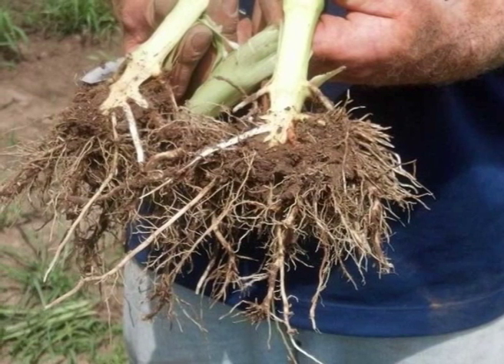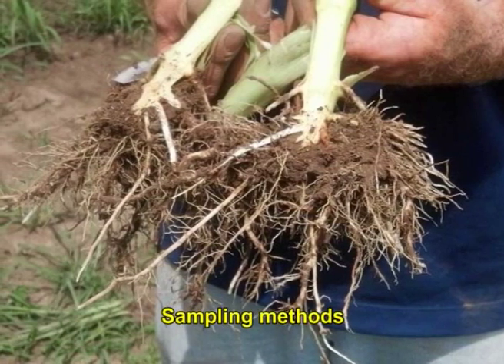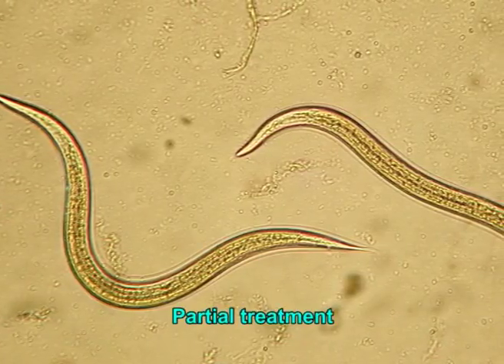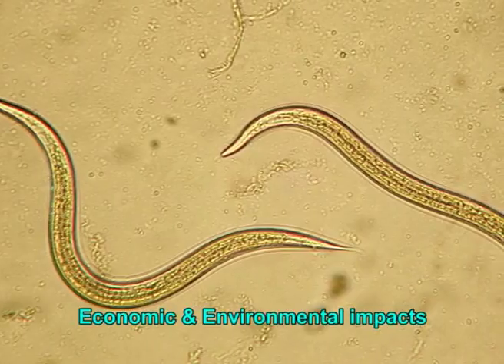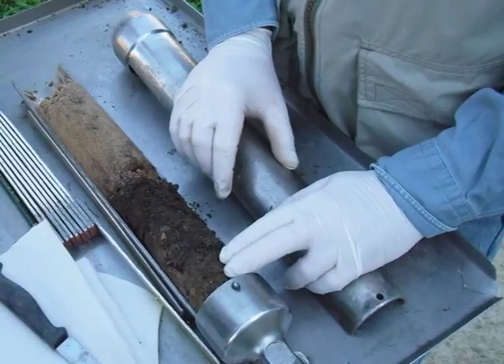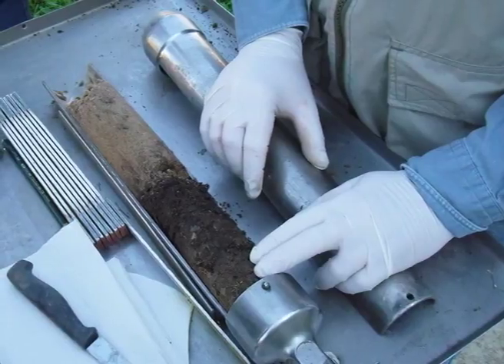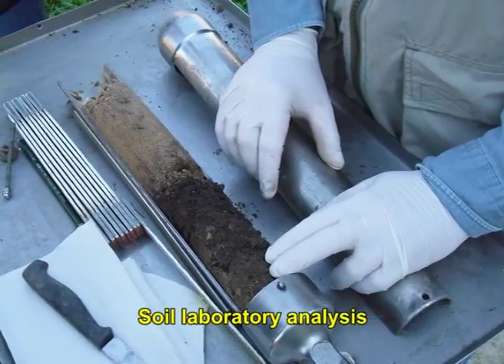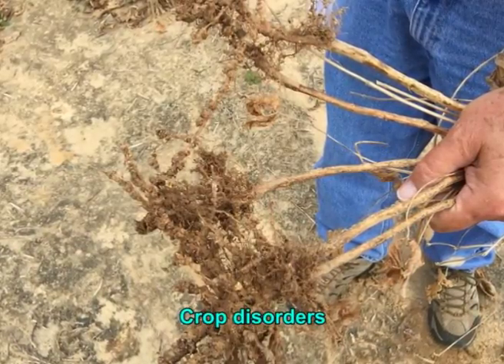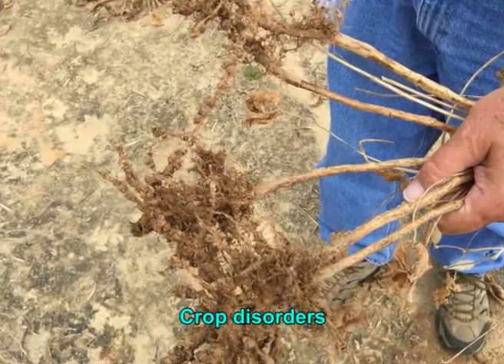The patterns of nematode distribution in the field may also be detected using sampling methods. Discovering the nematode distribution in the field may permit partial treatment, reducing the economic and environmental impacts of the methods used. Therefore, accurate diagnosis of nematode-induced disease or injury generally requires soil laboratory analysis. The first step in the diagnosis of crop disorders caused by nematodes includes collection of soil samples and roots of the nematode-infected plants.